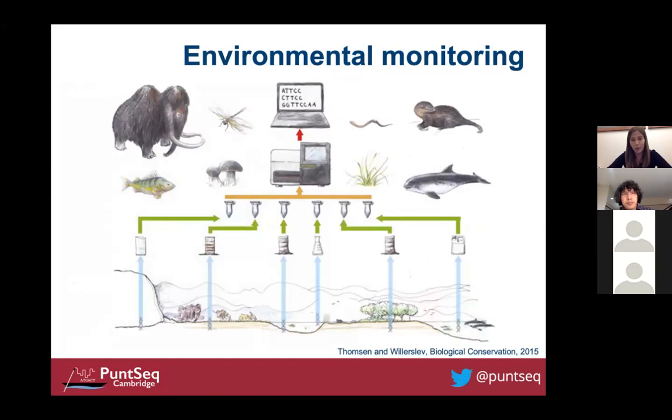As you probably all know, metagenomics just means that you can sequence all the DNA that you find in a sample. If you apply it to environmental samples like soil or water or even air, you basically just sequence all the DNA that you find in these samples and can determine which species occur there. So in this study, we were particularly interested in bacteria.